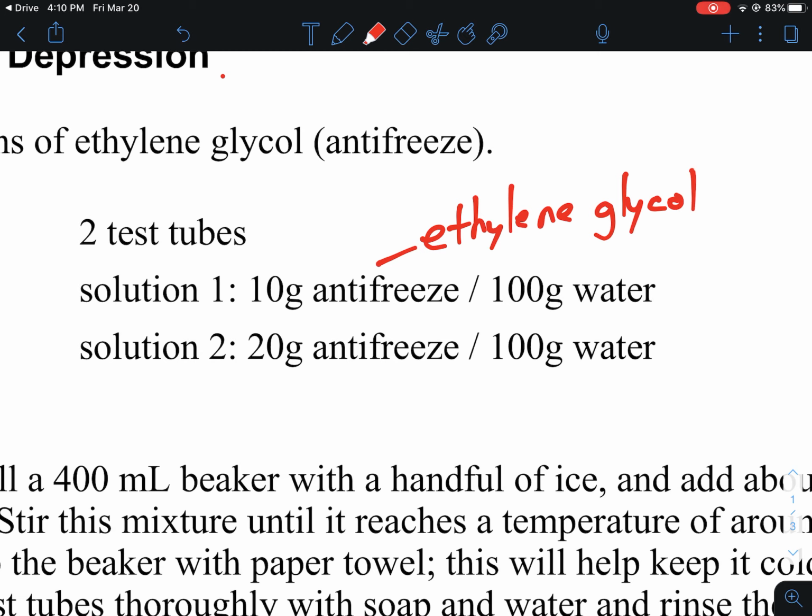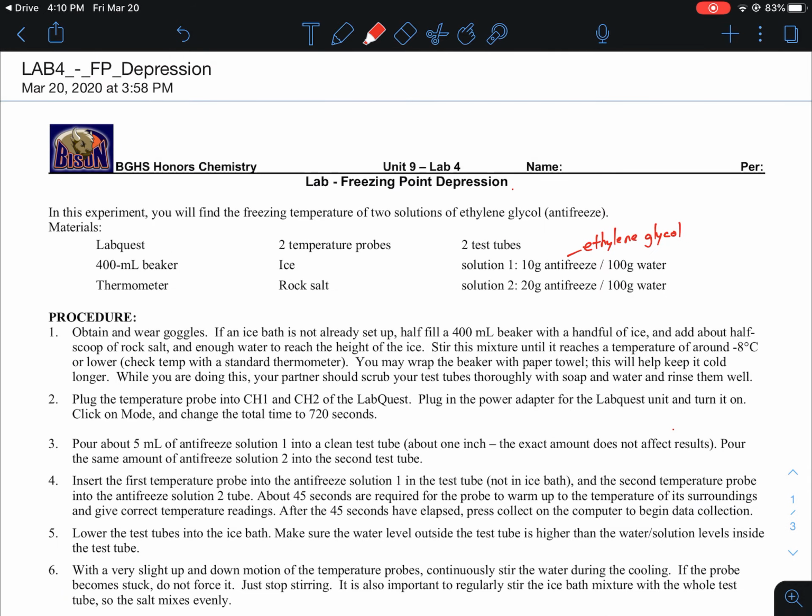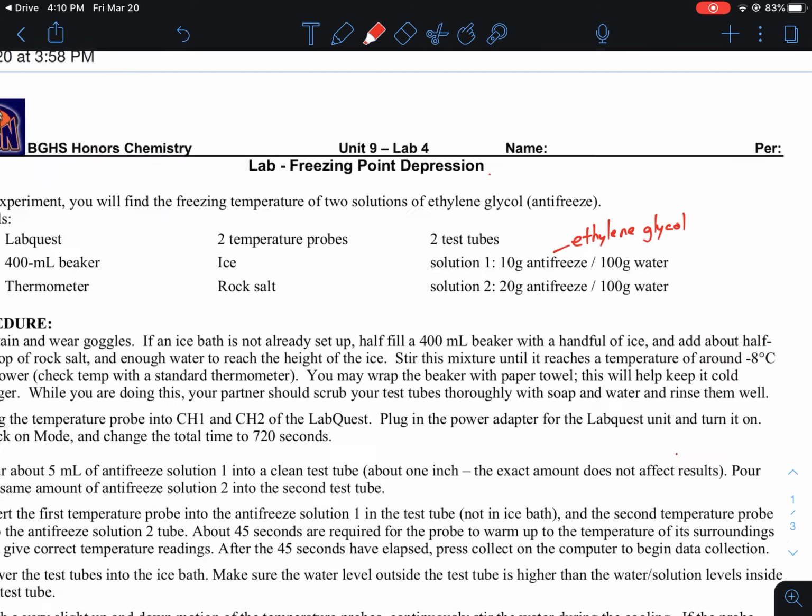So you have the ability to turn this mass of solute and this mass of water into the different units you would need. Maybe it's moles of the solute, maybe it's kilograms of the water. I don't want to give you too much information right now because that's something you're going to have to work through in the analysis portion.